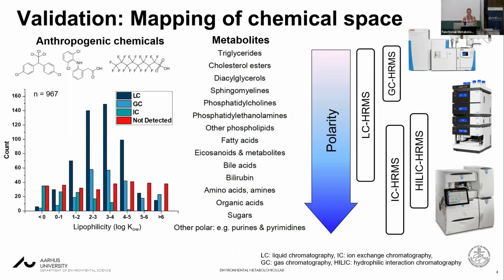Yeah, it's a very good point, how we do sample prep and how we are sure that we can capture everything. Well, there's no method that can capture everything, so we are just trying to capture as much as possible. We do a basic, fundamental solid phase extraction, and then we close our eyes and capture what we capture.